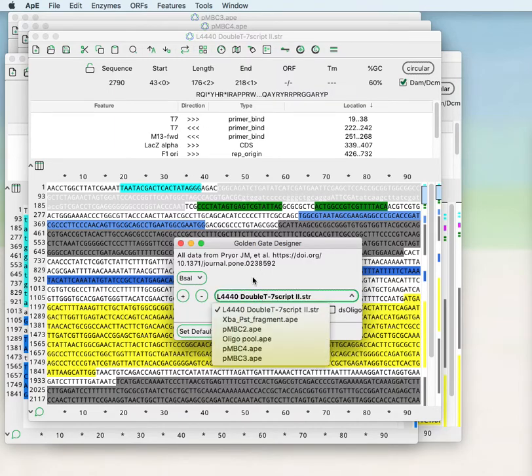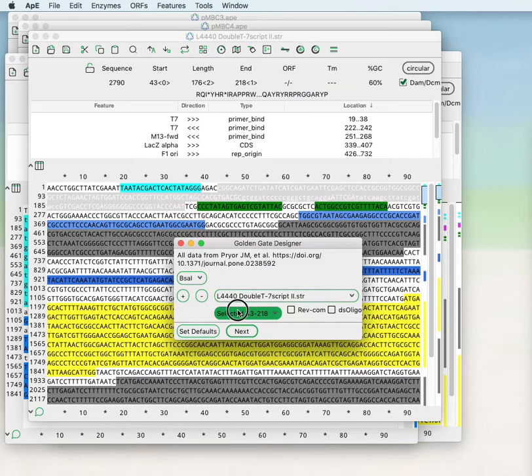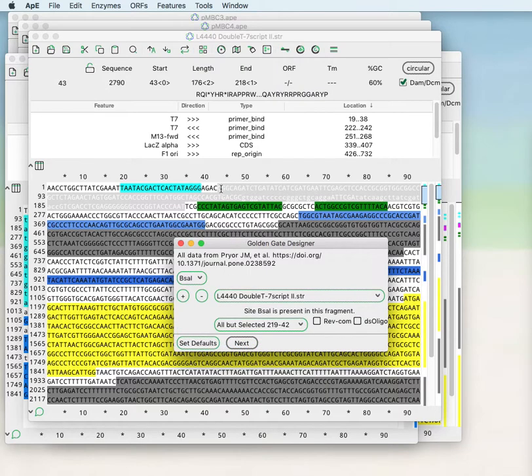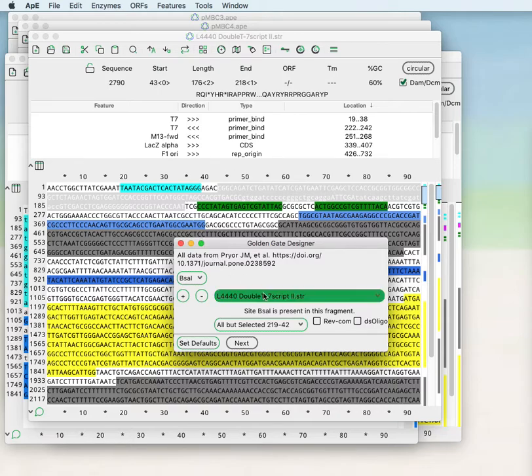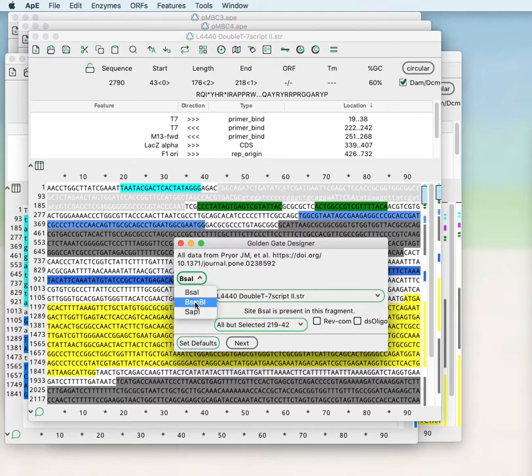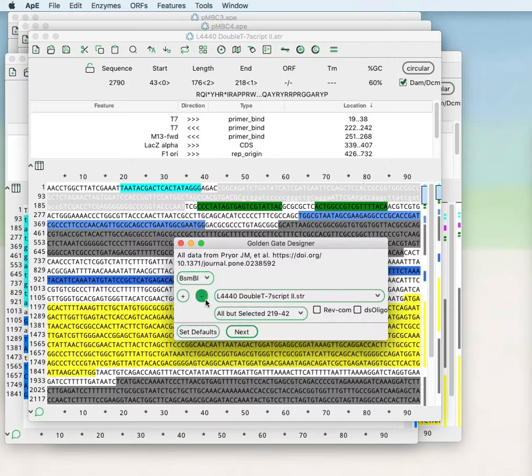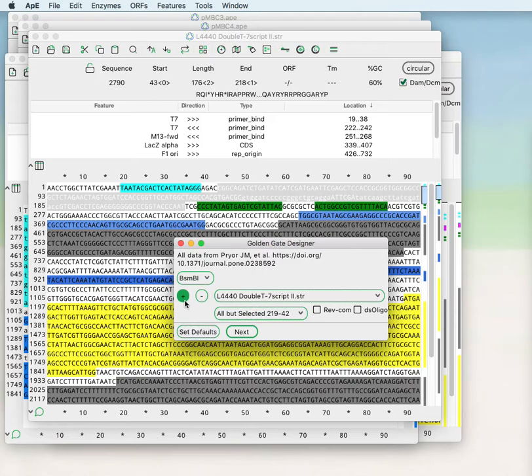We can choose all but selected so that we replace the selected region with our inserted fragments. We find that there is a BSA1 site present in that fragment of DNA. So we have to choose a different restriction enzyme to do a Golden Gate reaction.